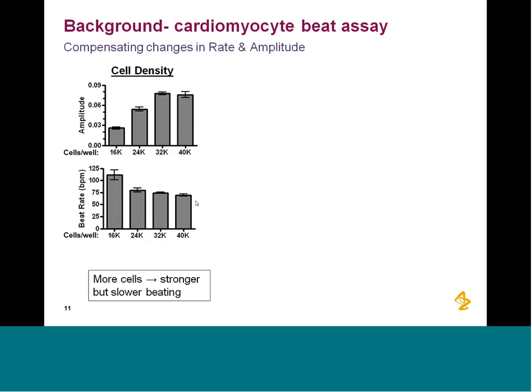And under normal conditions, that additive calcium would lead to stronger contractions. But in the case of a neonatal cardiomyocyte, the sarcoplasmic reticulum is not well formed, and so you don't get that feedback enhancement. So this all fits with the biology, but it complicates the interpretation. Not in a prohibitive way, but just it's something that you need to be aware of. And if you're aware of it, I think it's straightforward to handle.